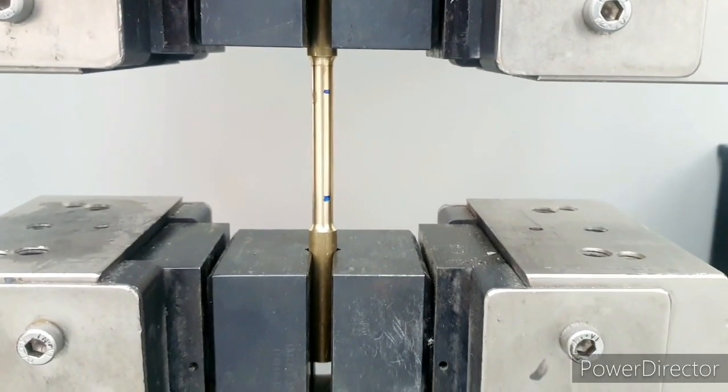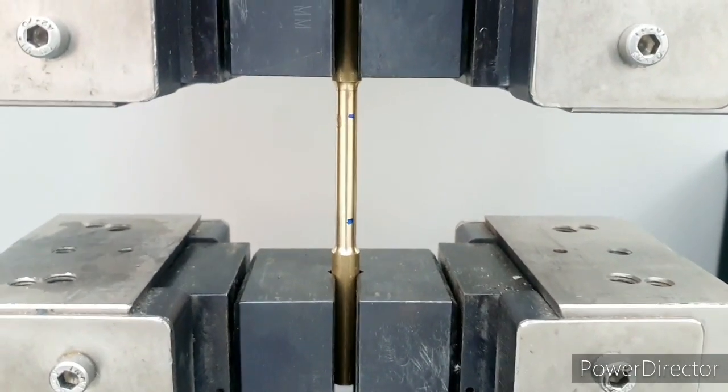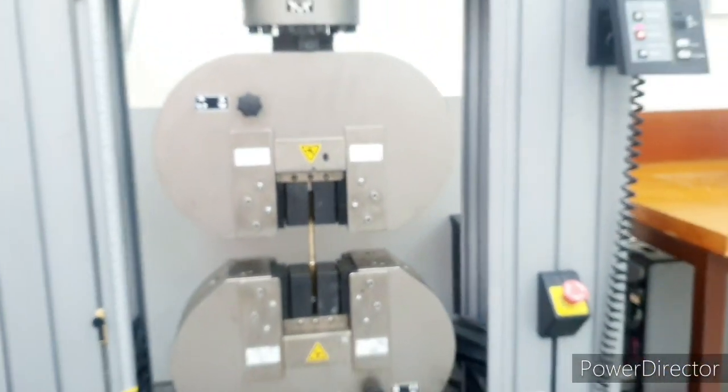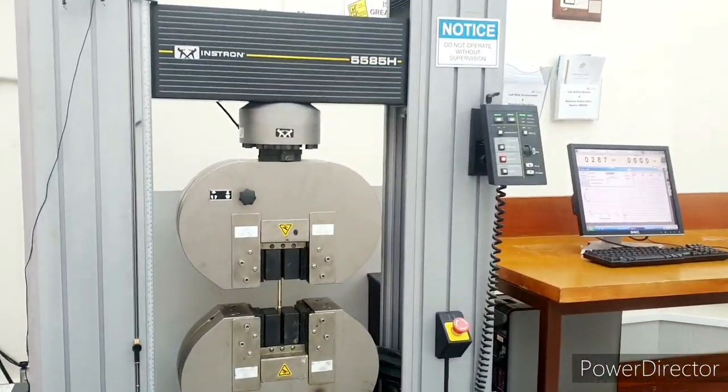In the same way as we did the steel and aluminum sample, we have now mounted the brass sample. You can see the brass material is gold in color. Here the brass sample is mounted in the Instron testing machine, and we are ready to run the sample.